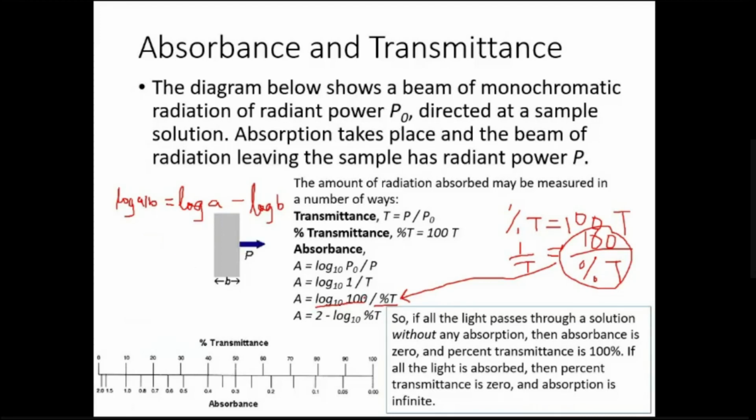But log of 100 to the base 10 is 2. So absorbance is equal to 2 minus log of percent T to the base 10.